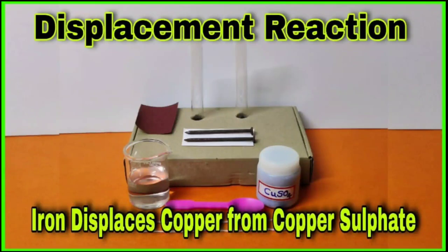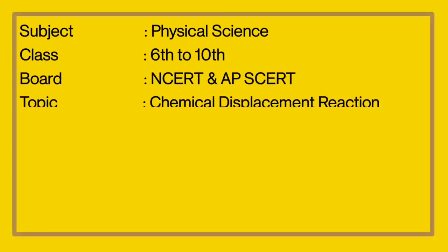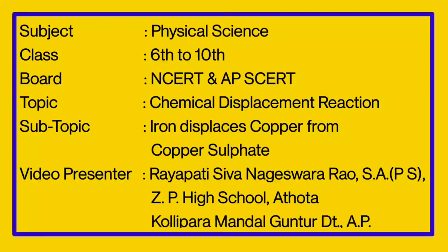Hello students, today I demonstrate a displacement reaction. Iron displaces copper from copper sulfate solution.